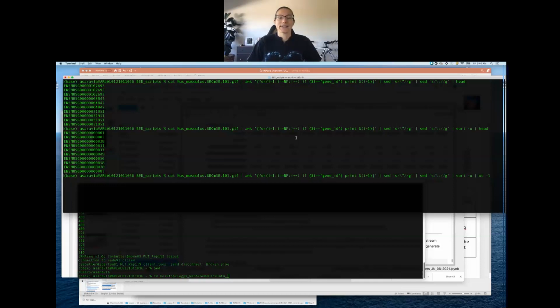Because I had made that statement that we have multiple Ensembl gene IDs representing the same gene name or gene symbol. I had remembered running into that previously, which is why I mentioned it. And that number that I told you of around 25, 30,000 genes, in actuality I was thinking coding genes, so I'm sorry. There's more than just coding genes that are annotated, of course. So my fault for that.